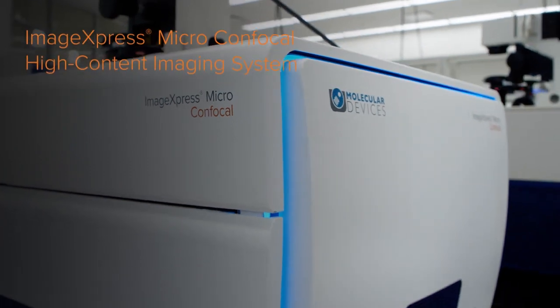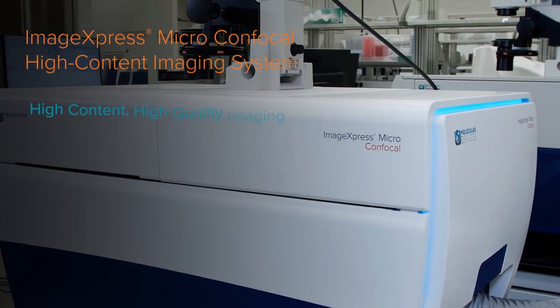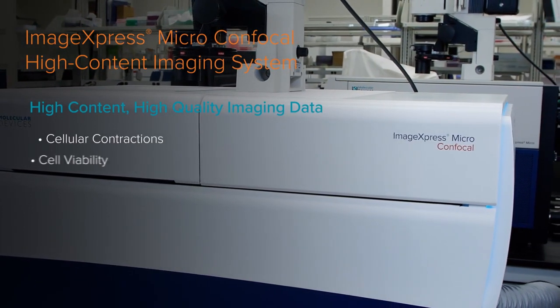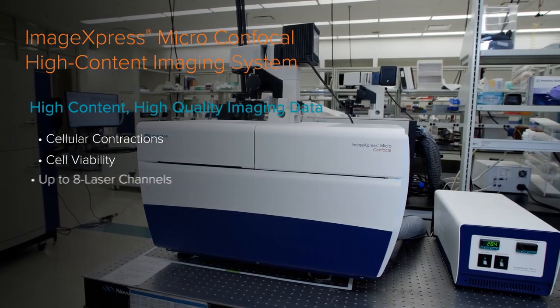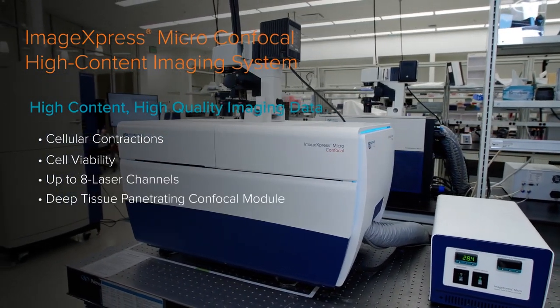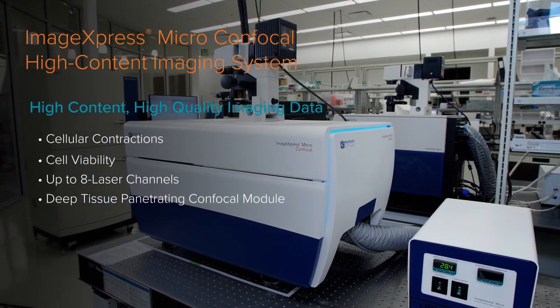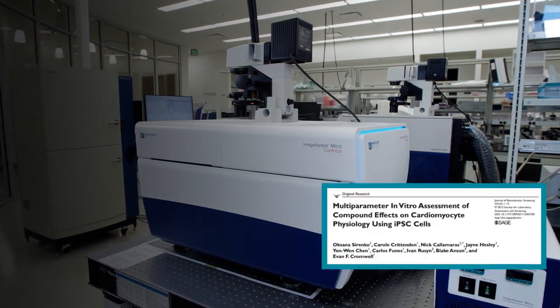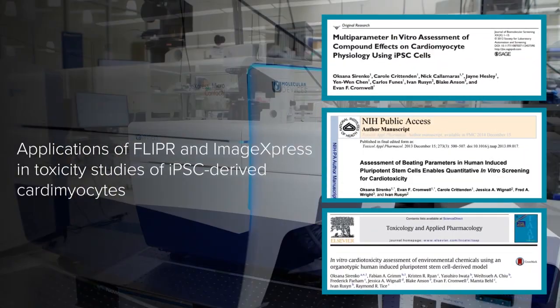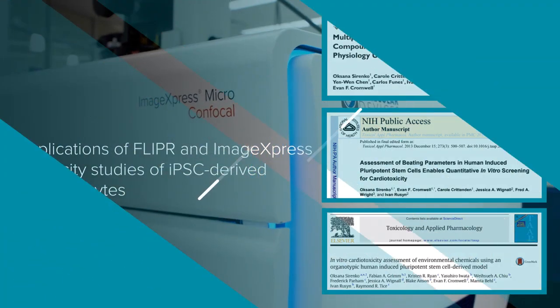To complement screening on cardiomyocyte function, the ImageXpress Micro confocal system can provide high content and high quality imaging data on cellular contractions and overall cell viability. With up to 8 laser channels and a deep tissue penetrating confocal module, the ImageXpress is capable of multiple imaging feats, from 3D assay development to screening. Multiple studies have validated the application of FLIPR technology and ImageXpress imaging in toxicity studies of iPSC-derived cardiomyocytes.